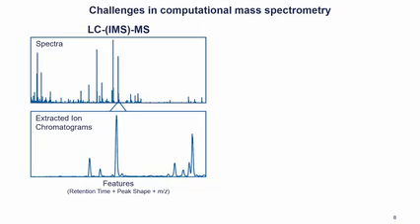Okay. So to be more specific, if we talk about ion mobility combined with chromatography and mass spectrometry, like in this example, LC-IMS-MS, we have mass spectra, which are collected both in the time dimension and in the ion mobility dimension. Okay? And from these, we can produce extracted ion chromatograms, which give us some peaks, and we want to detect those peaks.